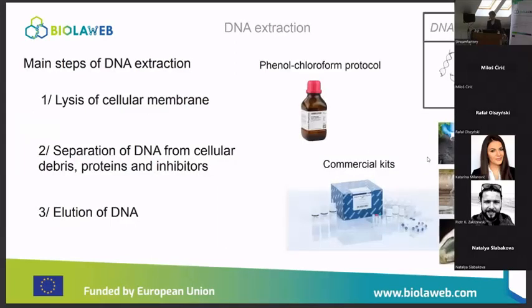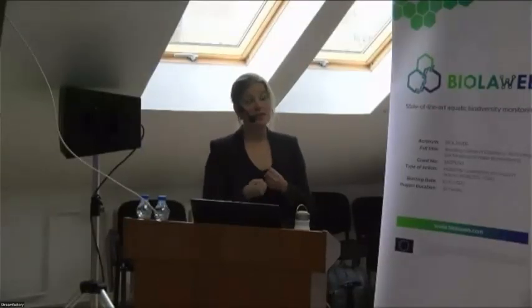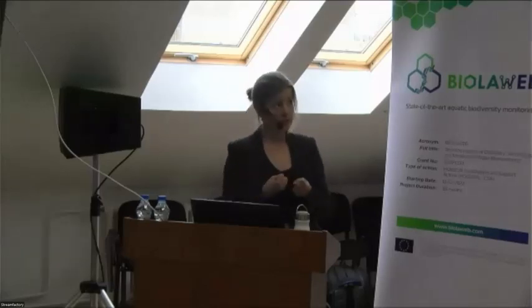So the first part, the lysis of the cellular membrane. For that, we have plenty of solutions that can be grouped in 3 main categories. The first one are the physical lysis of the cellular membrane, where you can break the cells either with mechanical forces.